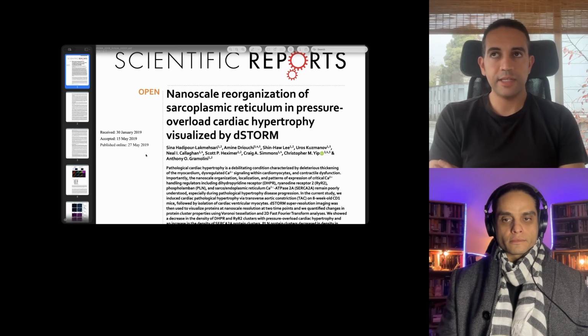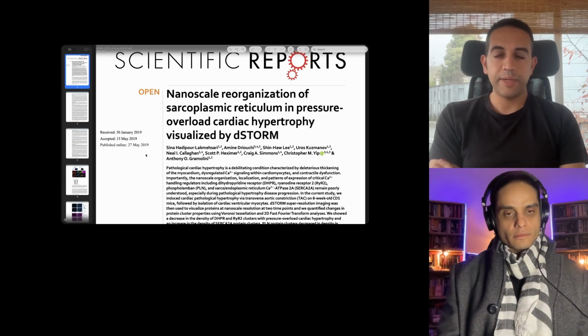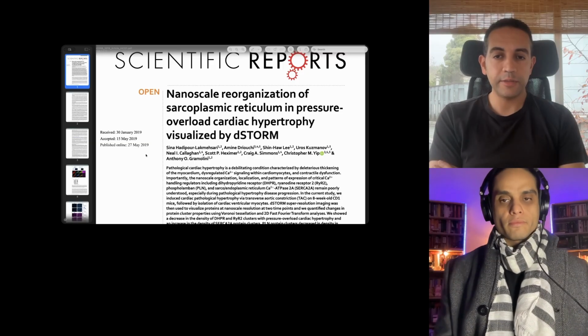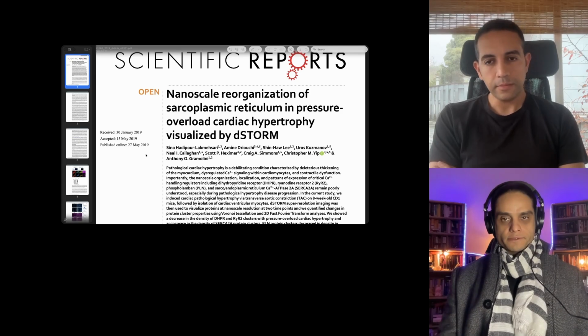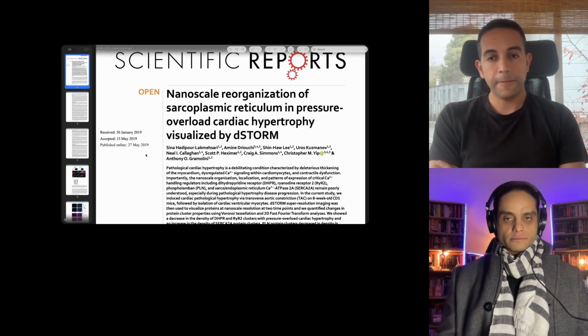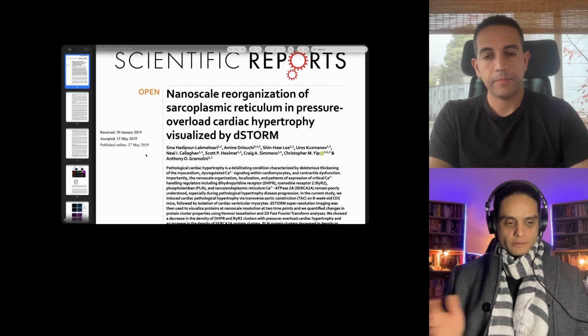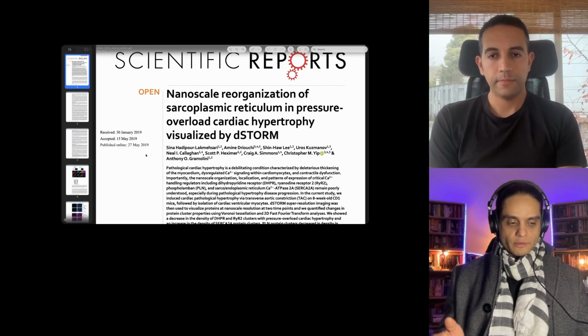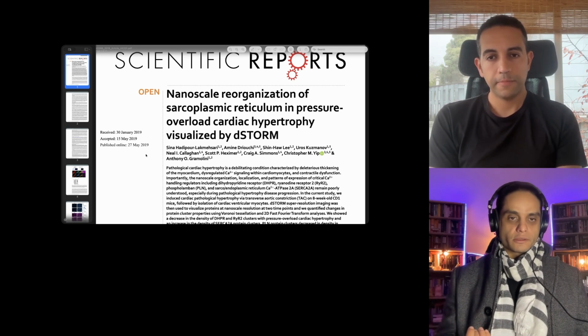But in asking yourself, as we did here, whether a disease phenotype is meaningfully impacting the spatial distribution of something in 2D, then you can address it that way. I see. So basically you can do X and Y fairly out of the box, but if you need Z, you get it but decrease the strength of the signal. Yeah, and there's just no free lunch in this equation.